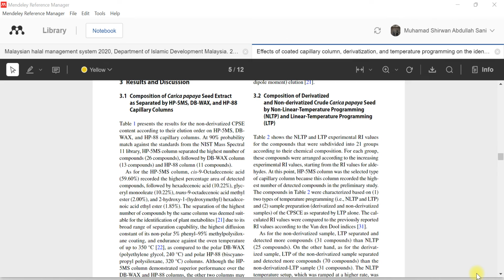Untuk esok, tak apa saya ajar dulu. Saya ajar dulu. Cuma dia is not as detail of saya punya workshop yang multivariate tu. Saya hanya pakai untuk authentication mungkin 2 test saja. Ada PC, ada discriminant. Kalau yang multivariate yang itu kita ada pakai discriminant, cluster, macam-macam lah.